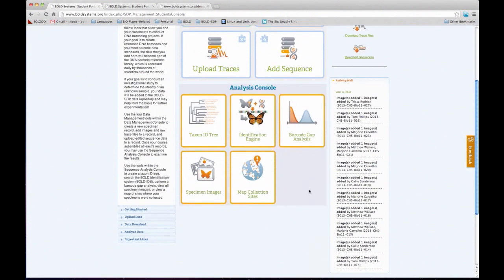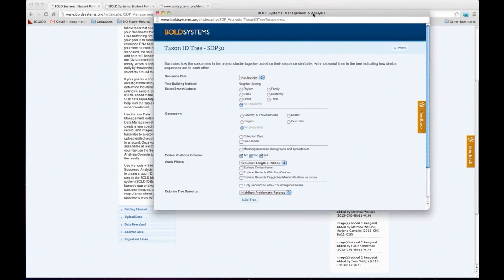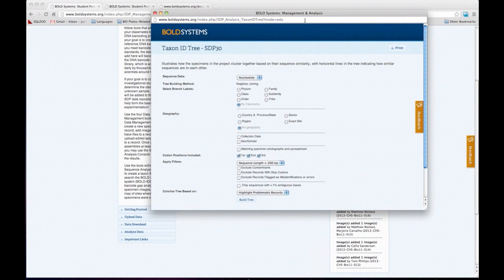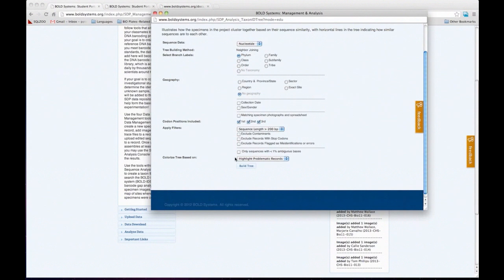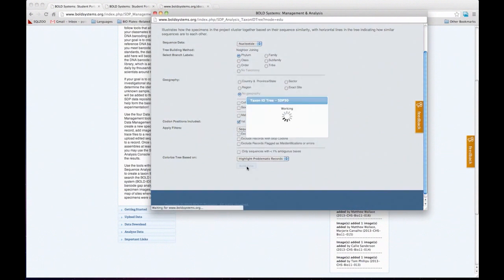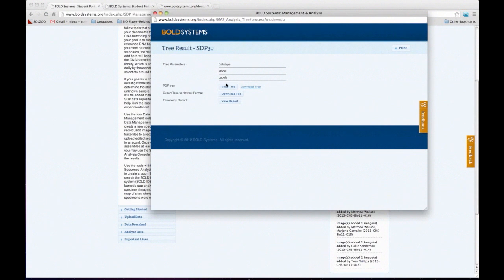The analysis console has the major tools used by Bold. This is where it gets really interesting, because the system allows students to play with the data and ask the same scientific questions that scientists are asking. When I click on these buttons, it basically analyzes the data for the whole class. I'm going to click on View the Taxonomy Tree — this is, as I mentioned, the most commonly used Bold tool. You choose a few things: create a tree based on nucleotide sequences, have the phylum on the tree, and no geographic information. I'll leave everything else as is and click Build the Tree.